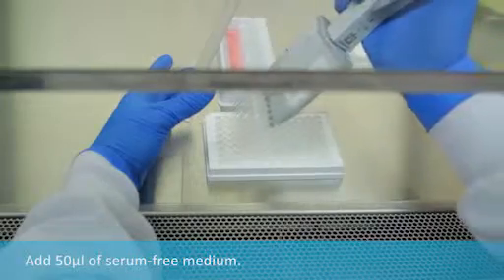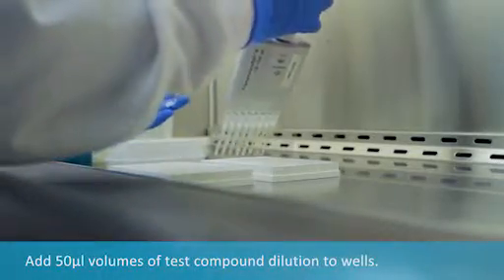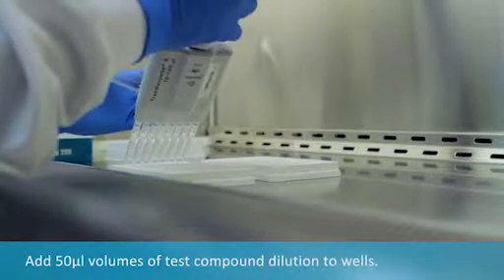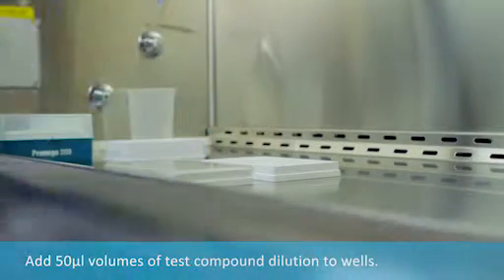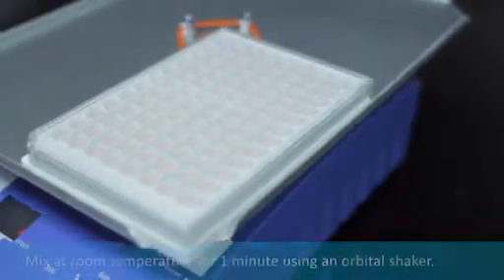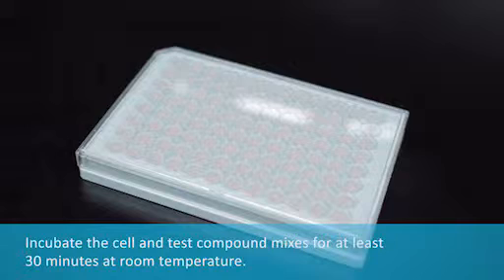Add serum-free medium. Add test compound dilution to the wells. Be sure to run the appropriate controls for your experiment. Mix at room temperature for one minute using an orbital shaker. Incubate the cell and test compound mixes for at least 30 minutes at room temperature.